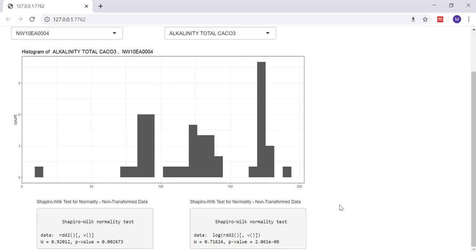If you're not familiar with statistics, don't worry too much about this. The next couple of comments are just additional details for the sake of transparency. The Shapiro-Wilk tests were done in R, and the confidence interval is 95%. As such, the threshold value for p is 0.05. If the p-value listed is less than 0.05, that means we can assume that the data for the selected variable at the selected site is significantly different from a normal distribution.